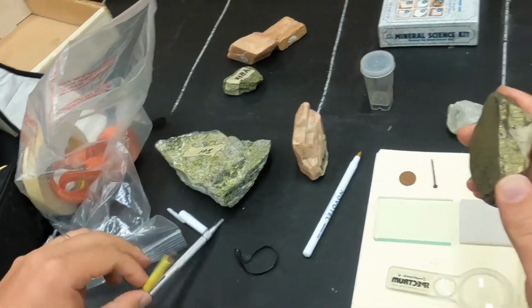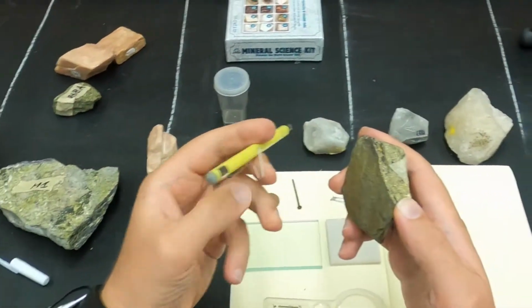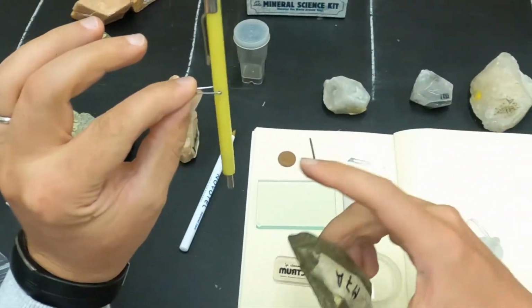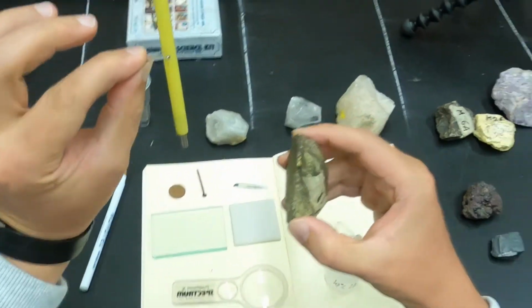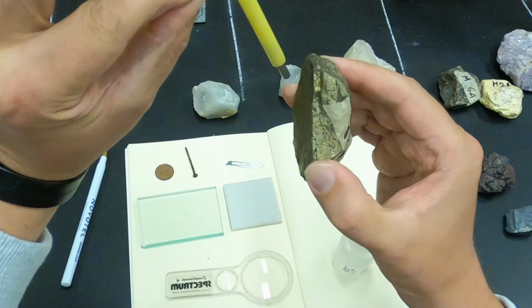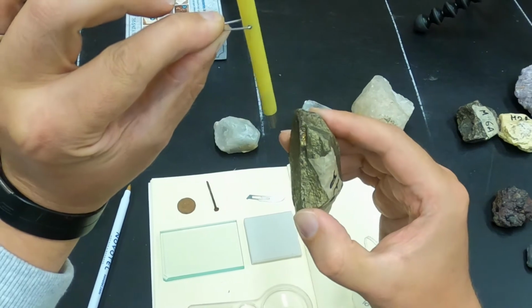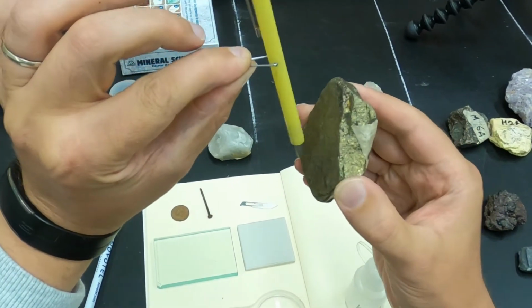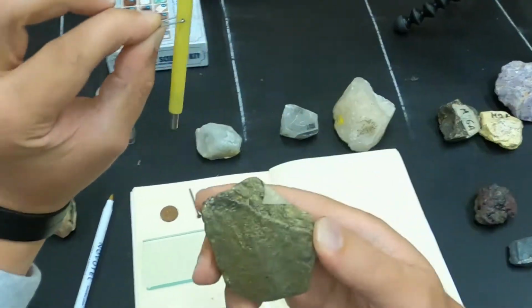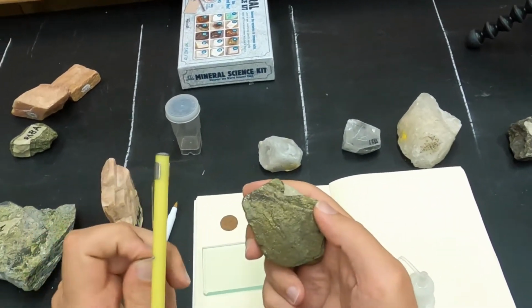In fact, we have other tools that commonly are used by geoscientists, especially when they do mineral exploration, like this pen here, which is magnetic on its tip, and so you can test weakly magnetic things if the pen moves, basically, and you can see that it moves quite a bit. So weakly magnetic minerals like that can be tested, and you can see that it does move still, because of course this mineral contains also chunks of this other mineral, which is pyrrhotite.